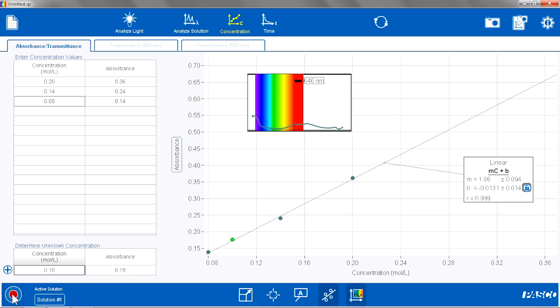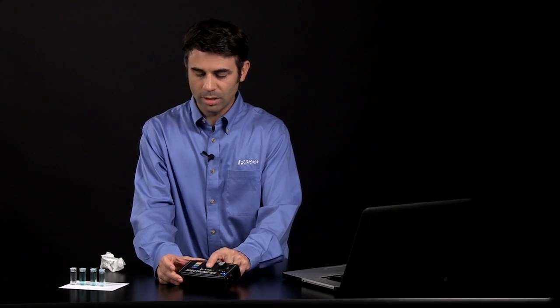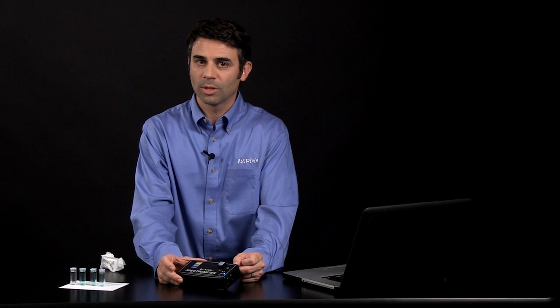So I'm going to stop data collection. So this has been doing Beer's Law analysis using the PASCO spectrometer. Thank you very much. This is Tom Loschiavo. If you have any questions or comments, please reach me at chemistry at PASCO.com. Thank you.